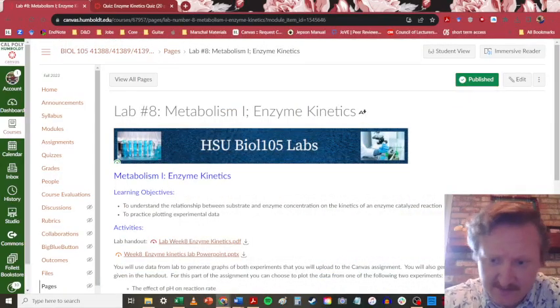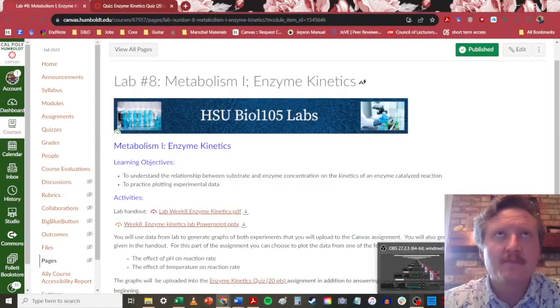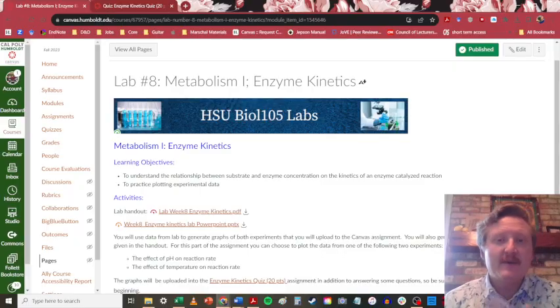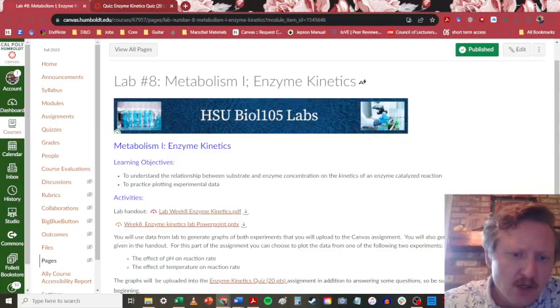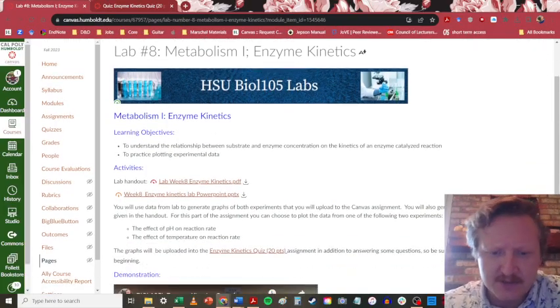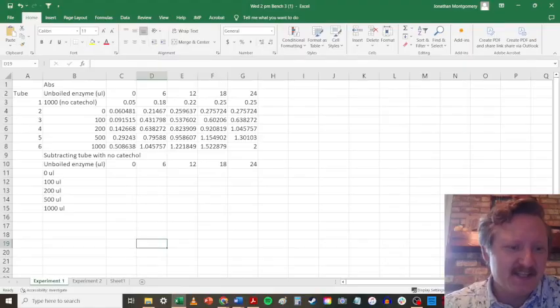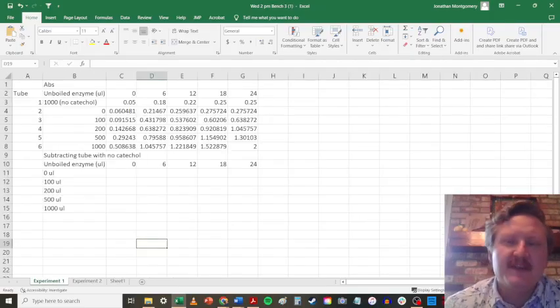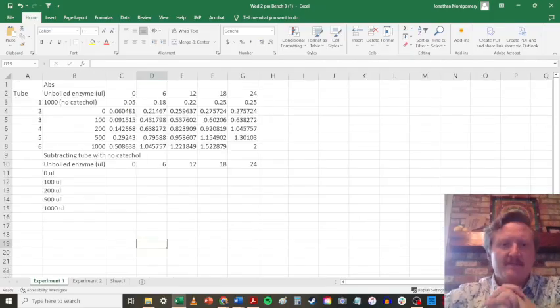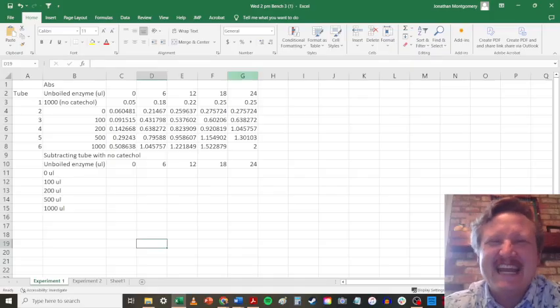All right, we're going to be doing a demonstration video for Enzyme Kinetics Lab for Biology 105. In this video, I'm going to be showing you how to take your data set, which is going to look a little bit like this, and I'm going to show you how to convert it into the figures that you need to submit for your assignment. I'm also going to tell you how to interpret this data.